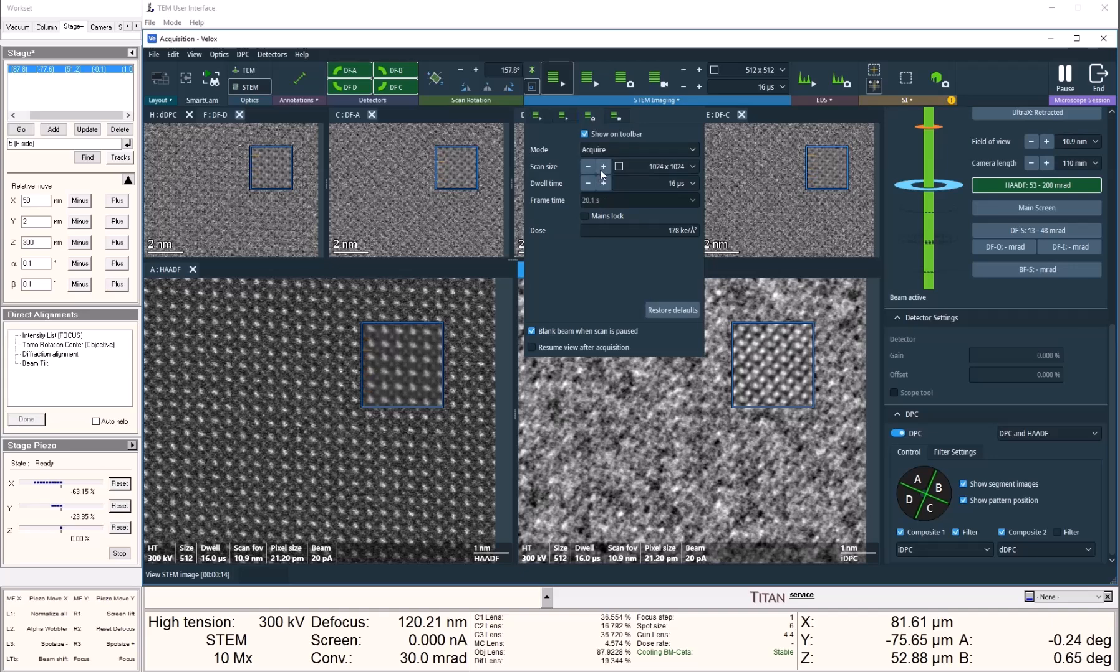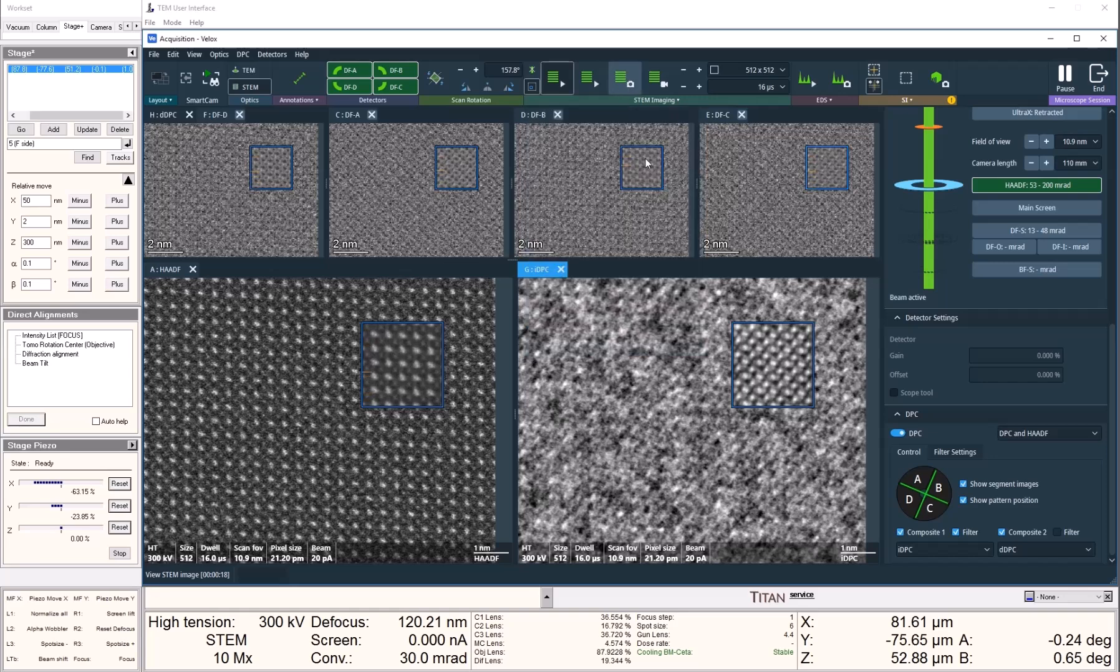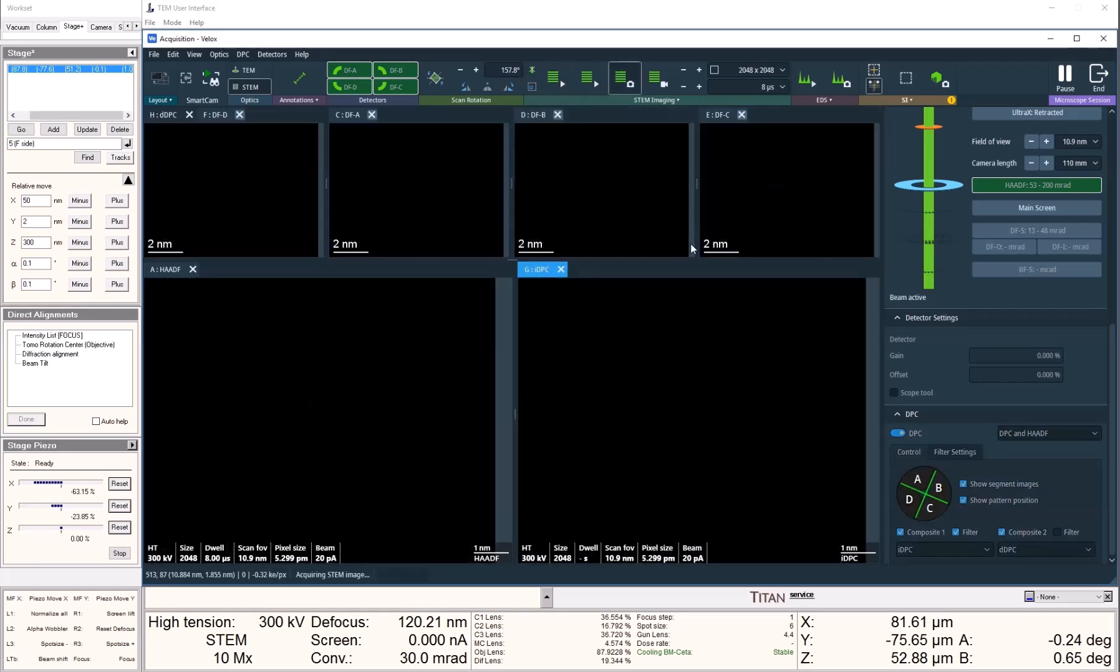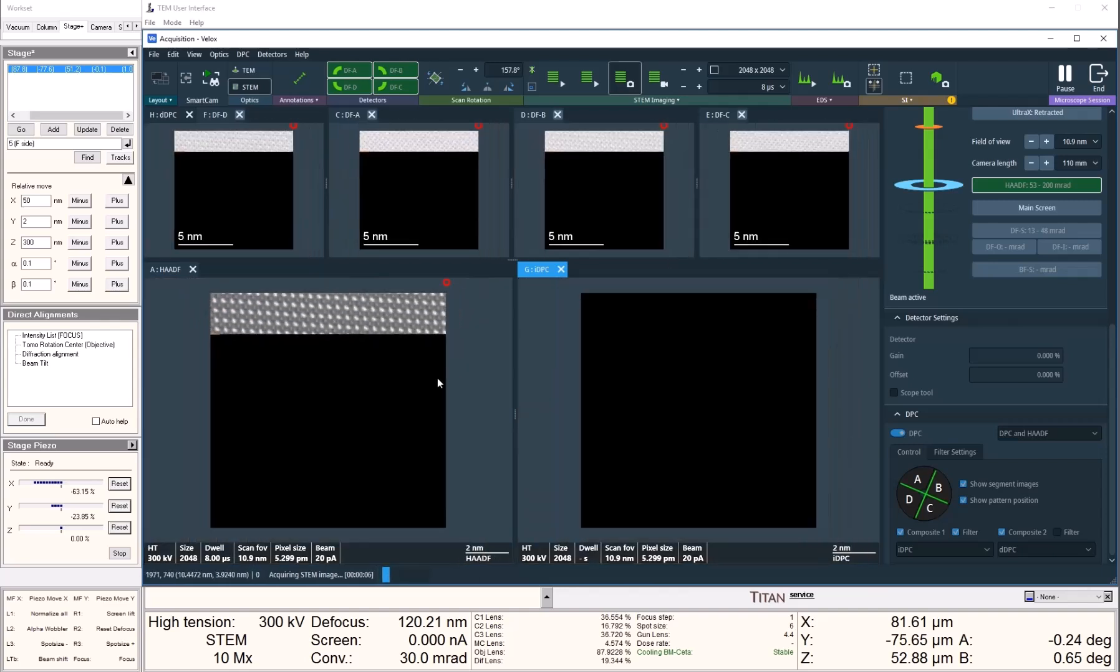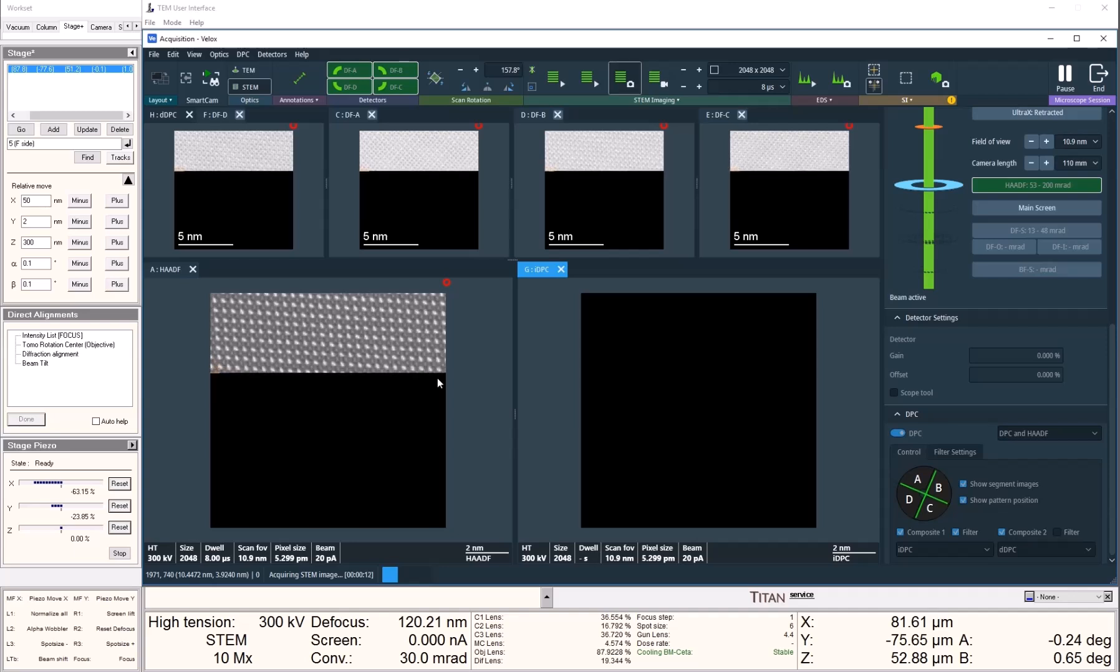When I'm satisfied with the focus, I can click the Acquire button on the top. This is now taking a 2K by 2K image with 8 microseconds of dwell time.